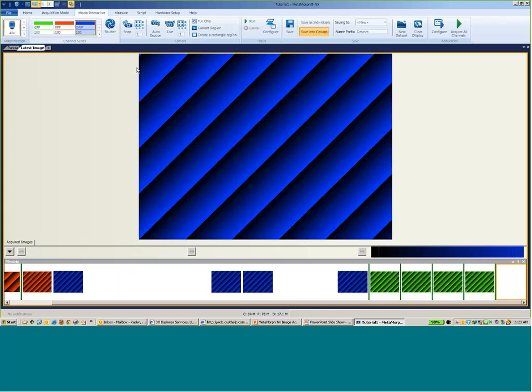So you can easily adjust your field of views by taking the tab, left mouse clicking and dragging it to the center and choosing how you want to display. Additionally, I can take the tab and bring it back and put it back in the list over here, to sort the order where you want it in that view.